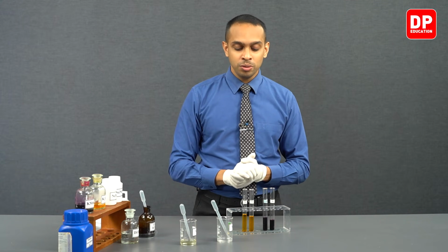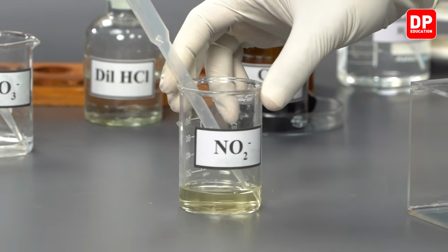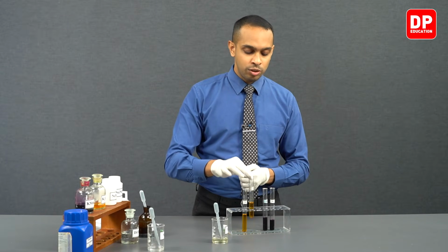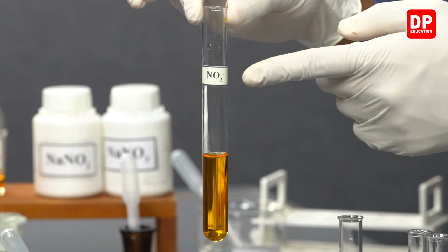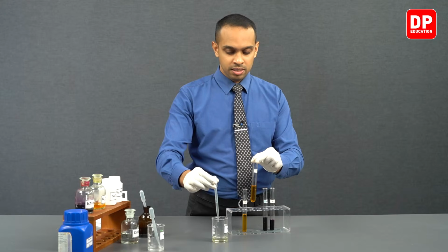Now let's move on to nitrite ions. So we have our nitrite ion solution here, and we have a test tube that has acidified potassium dichromate in it, labeled nitrite ions.